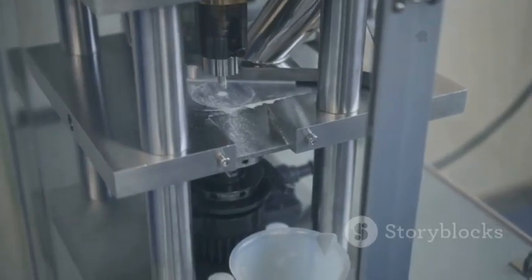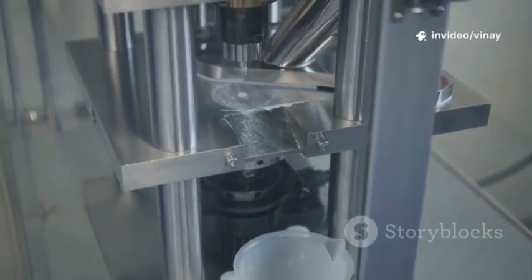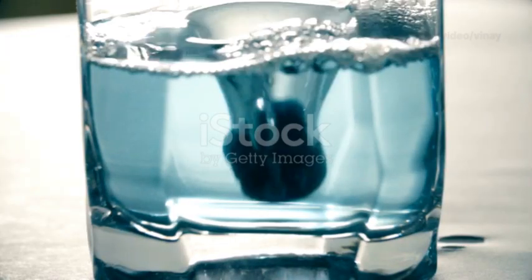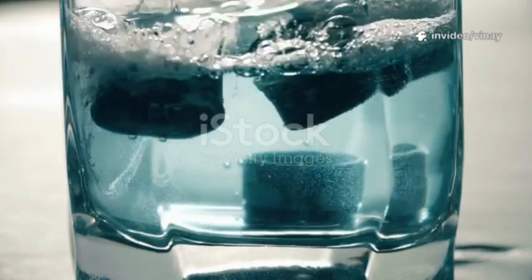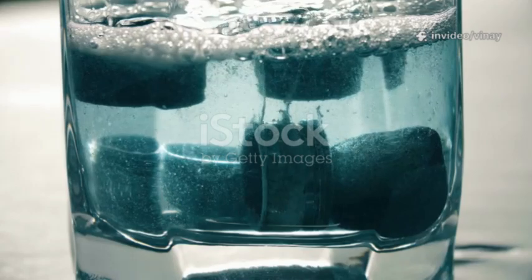But that's not the only way they work. There's another cool science principle at play called adsorption. Think of it like static cling. The surfaces of the filter fibers can have a slight electrical charge. As the liquid flows by, bacteria and other particles can get stuck to the filter material, almost like a sock sticks to your shirt when it comes out of the dryer. This adds an extra layer of protection, grabbing onto germs that might otherwise be small enough to squeeze through. So it's a combination of physically blocking them and electrically grabbing them. This dual action makes these filters incredibly effective at making liquids sterile.